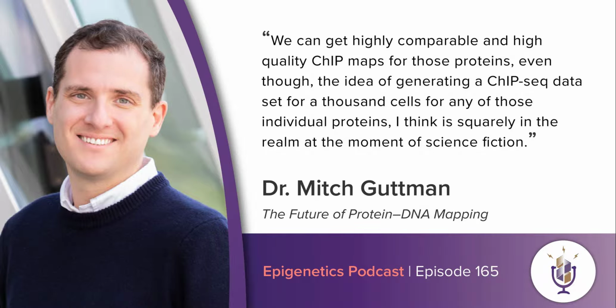Sure, absolutely. So maybe let's start, so everyone's on the same page, with the basic workflow of a ChIP experiment, which is that you take an antibody that would bind to your protein of interest, bind it to, for example, a resin like a magnetic bead, and then use that to immunoprecipitate a protein cross-linked to DNA. And then we sequence the DNA that's associated with that protein.